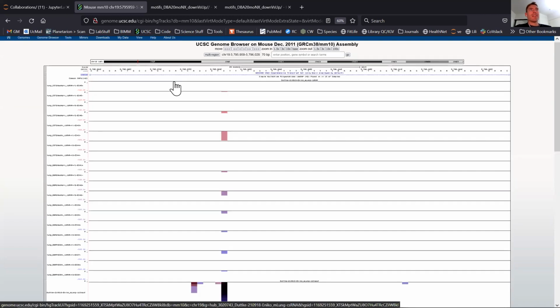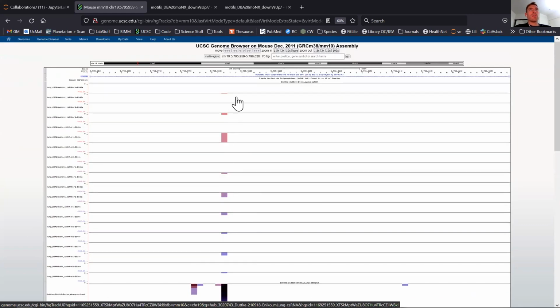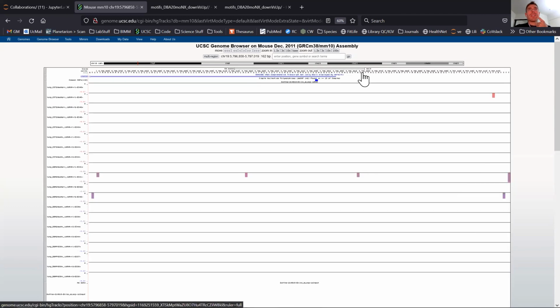And here you see that you actually have, particularly in the input, but also in your csRNA-seq, a good signal throughout your samples. So in general, csRNA-seq should be depleted for the exons. And if you're curious, you can also see, okay, is the gene expressed? And at least in these samples, it doesn't seem to be.